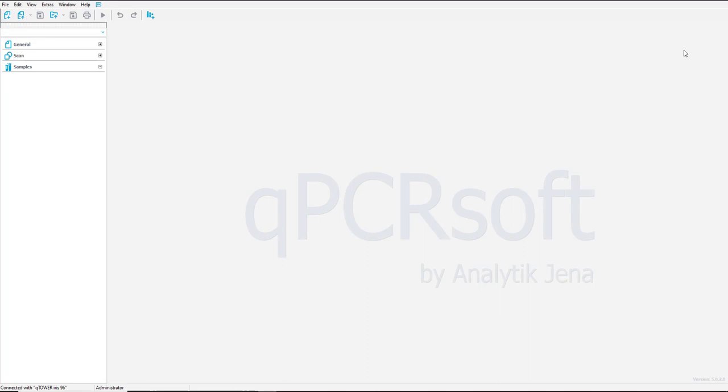In this video I would like to show you how to set up a melting curve analysis in the qPCR software. A demo data file of the analysis function is also available on the setup CD.